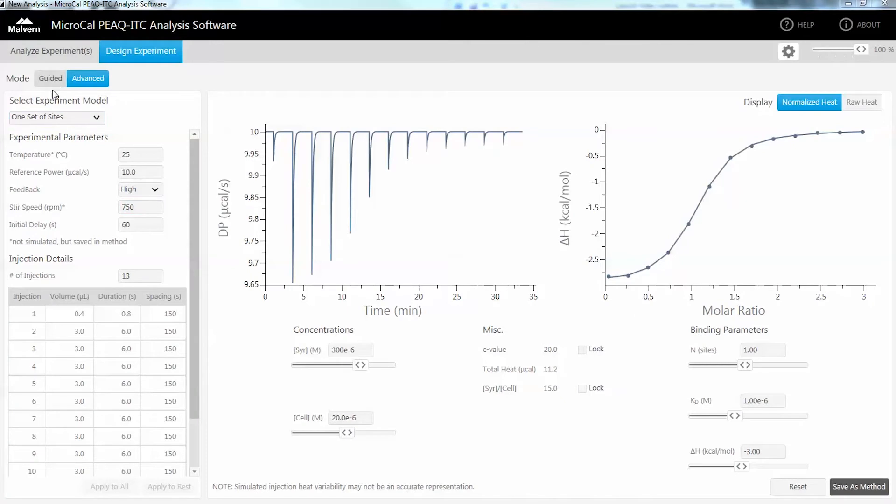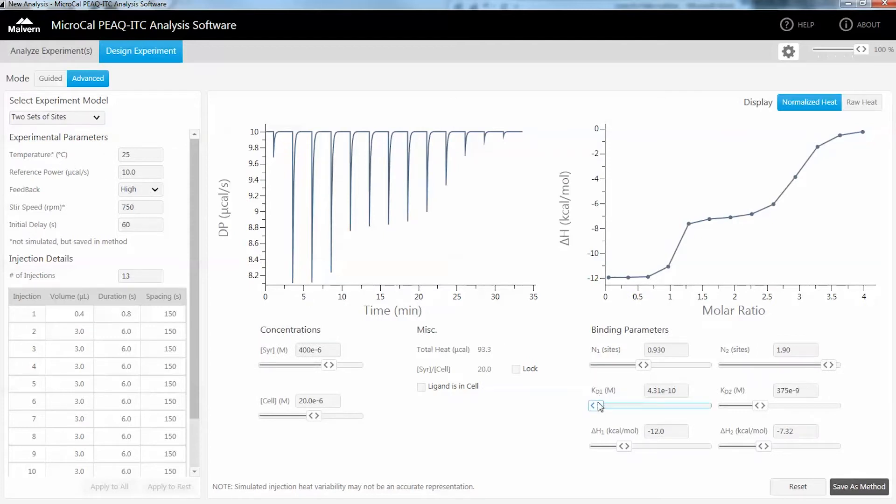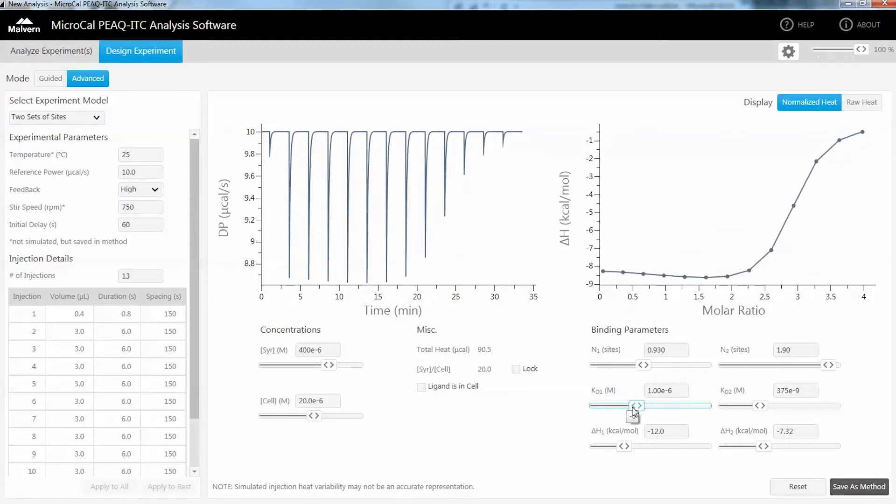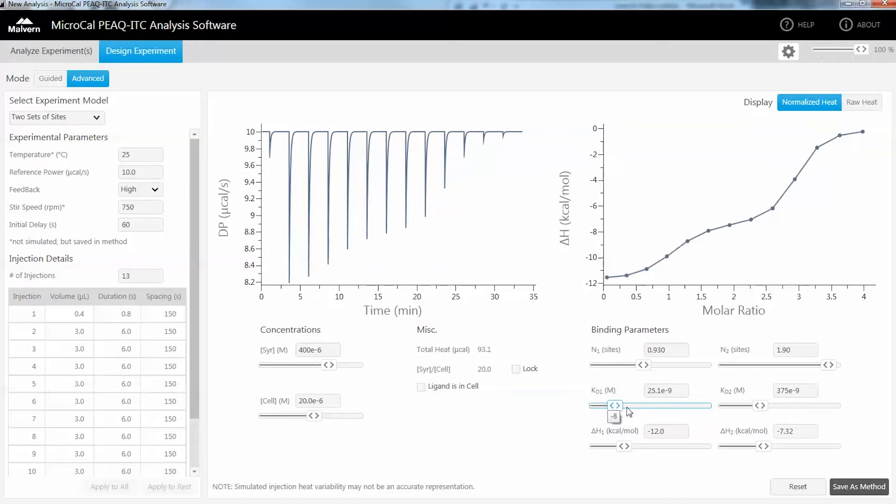When sample is precious or low concentrations are needed to accurately measure low nanomolar affinity interactions, or when the complexity of experimental design is significant, for example, in the case of competition titrations or binding interactions other than one-to-one, our advanced built-in experimental design tool facilitates the optimization of these experiments.